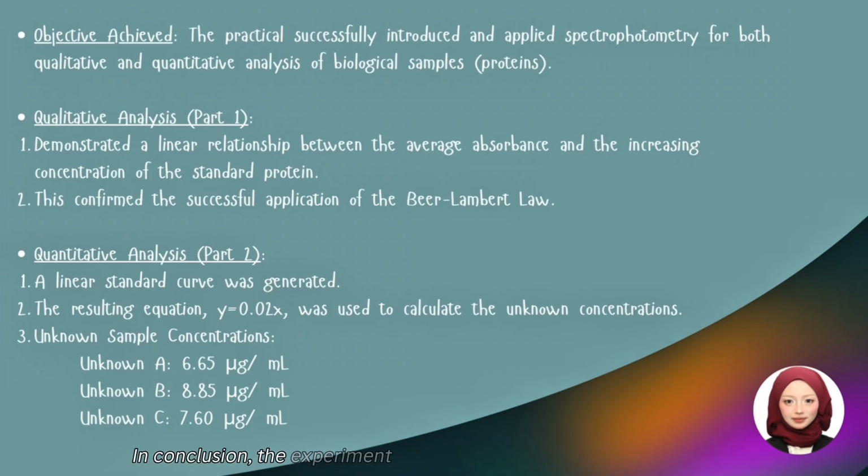In conclusion, the experiment successfully utilized the standard curve method to estimate unknown protein concentrations, demonstrating the reliability of the Bradford assay in biological quantification.